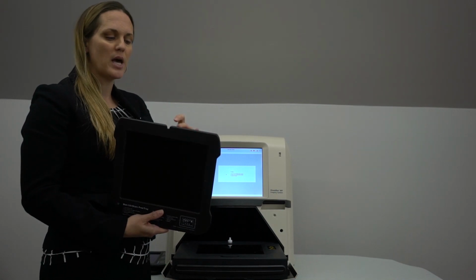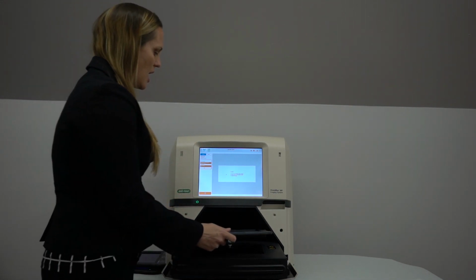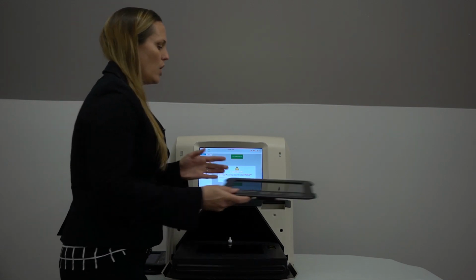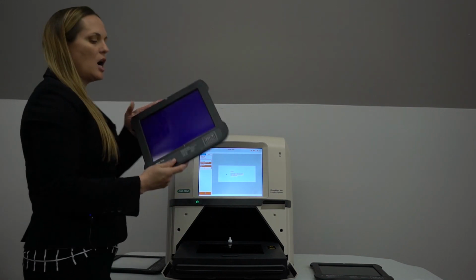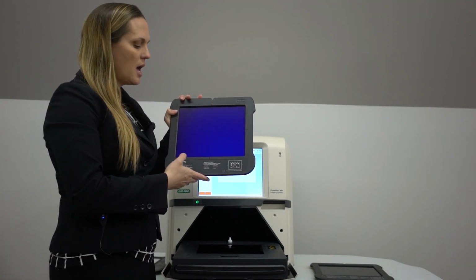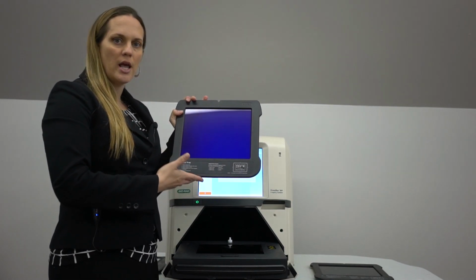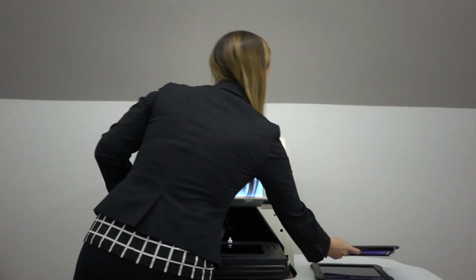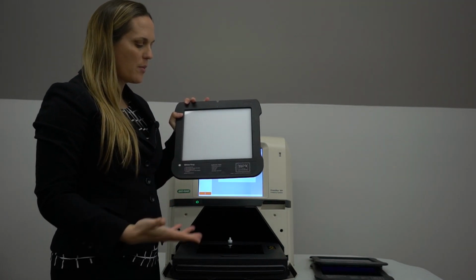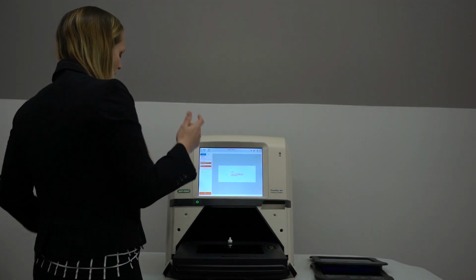It knows which tray it is by a little magnet here that slides into the groove here, so you can't use the wrong tray. So basically, it'll just slide right in there, and then you would close the door and take an image. We also have a blue tray. The blue tray is for your nucleic acid applications. If you're doing any SYBR staining, SYBR Safe, SYBR Green, your DNA, RNA gels, you'll be using the blue tray. And then we have a white tray. The white tray is for mostly your Coomassie blue staining, your copper stain, zinc stain. So we have a variety of trays.